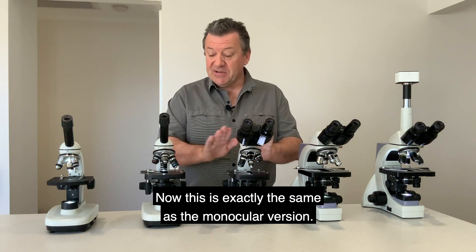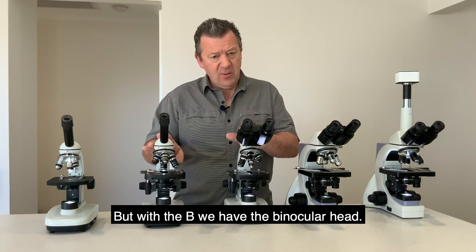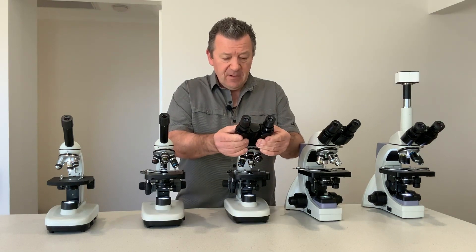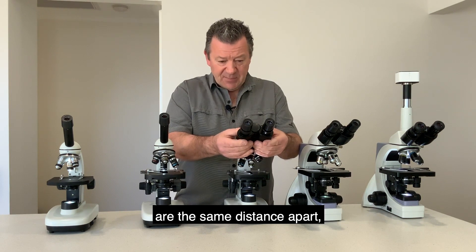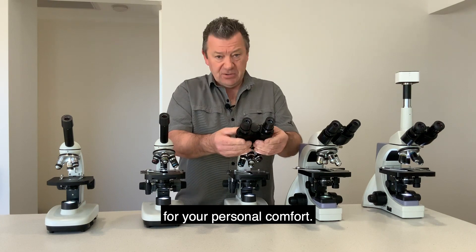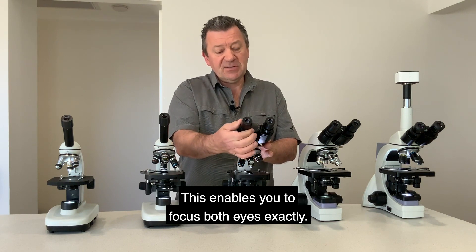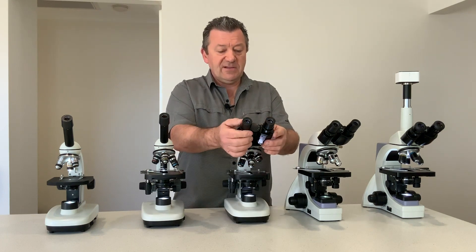We then move up to the N2000B. This is exactly the same as the monocular version but with the B we have the binocular head. It has adjustable interpupillary adjustment — because not everyone's eyes are the same distance apart — and we also have a diopter adjustment on one of the eyepieces to enable you to focus both eyes exactly.